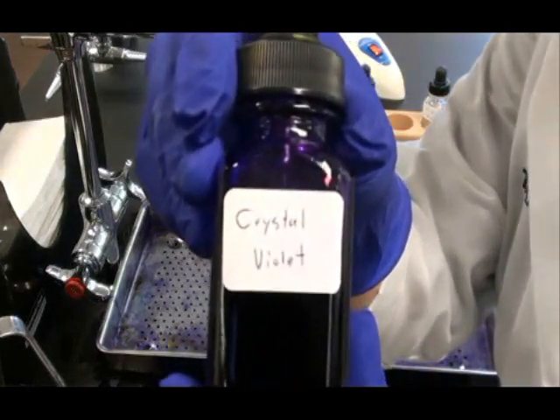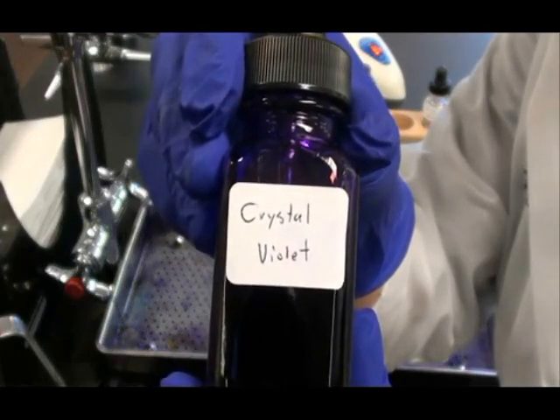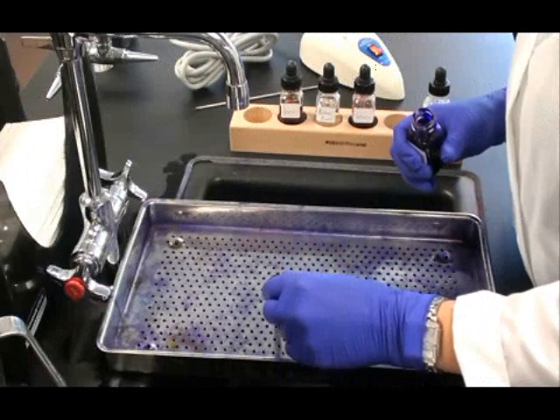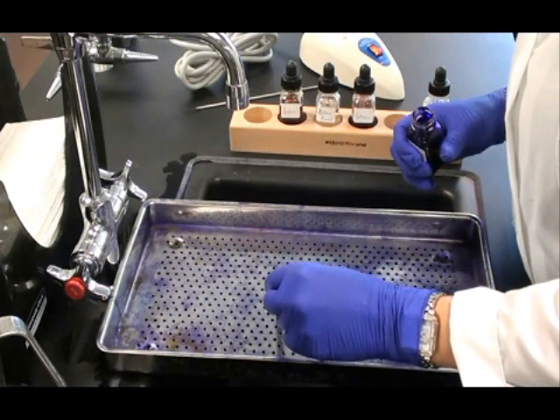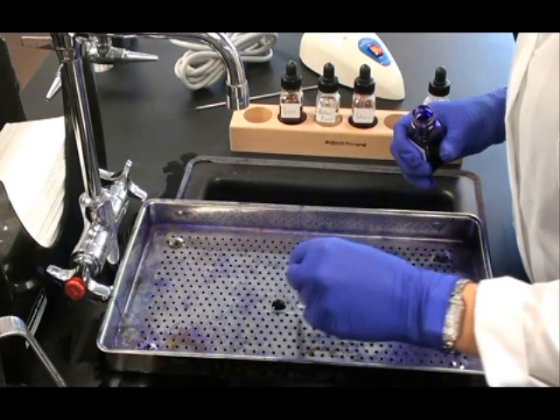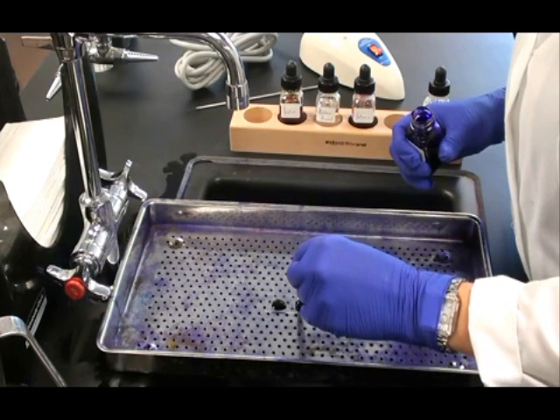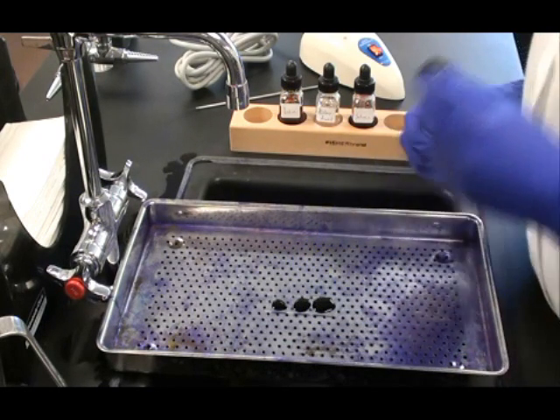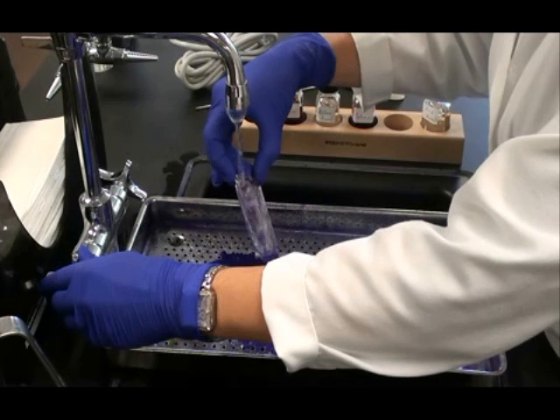So my first step is to apply Crystal Violet. This is my primary stain. I let drops of Crystal Violet fall onto all three of the smears on my slide. Then I wait for one minute.